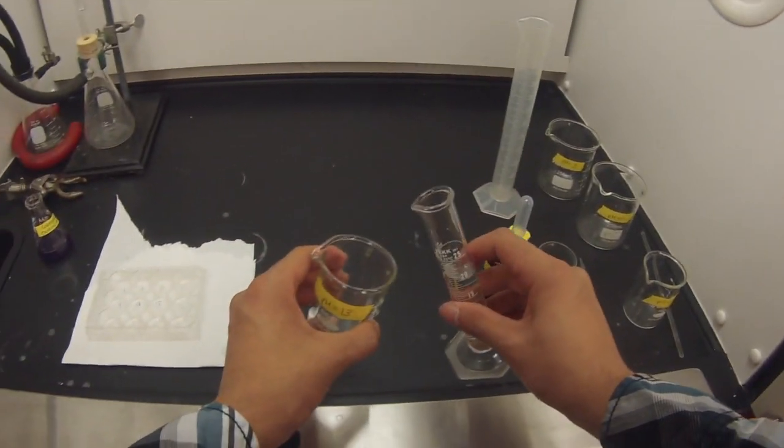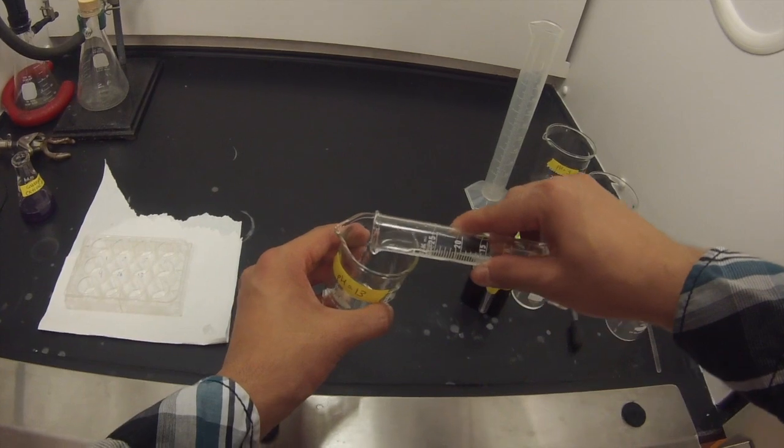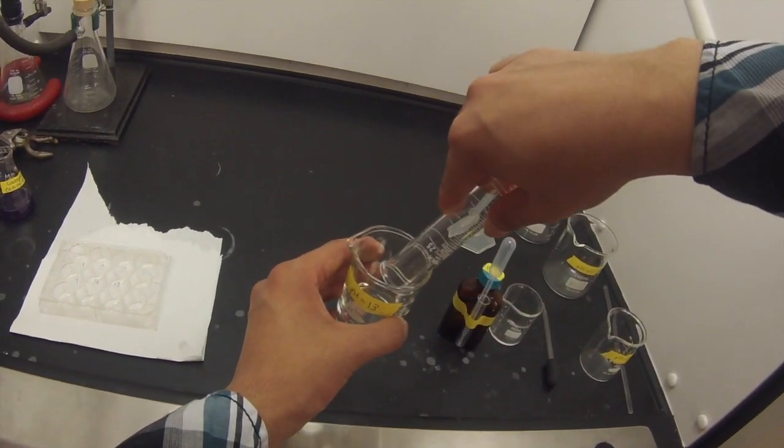Next, you'll take 20 milliliters of sodium hydroxide, add that to a 100 milliliter beaker labeled pH 13.